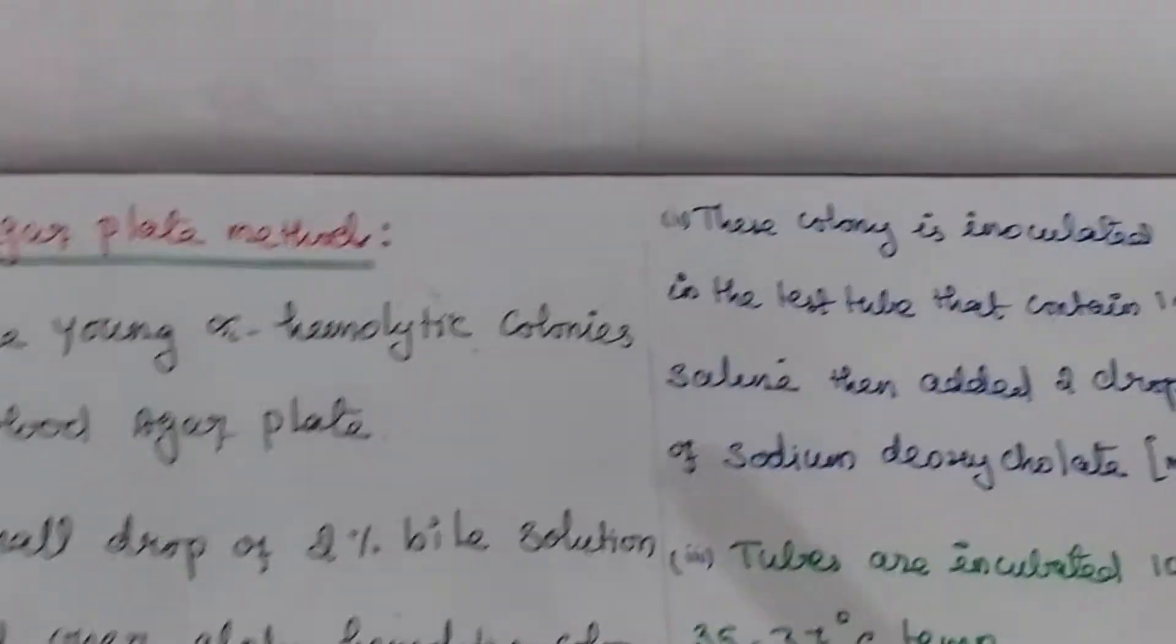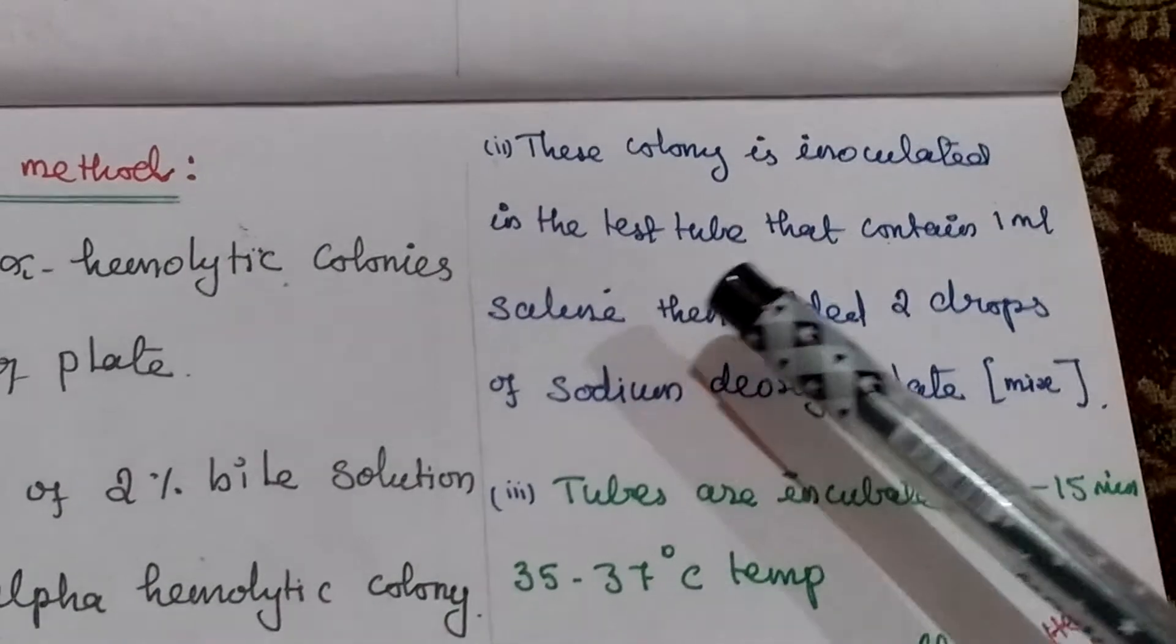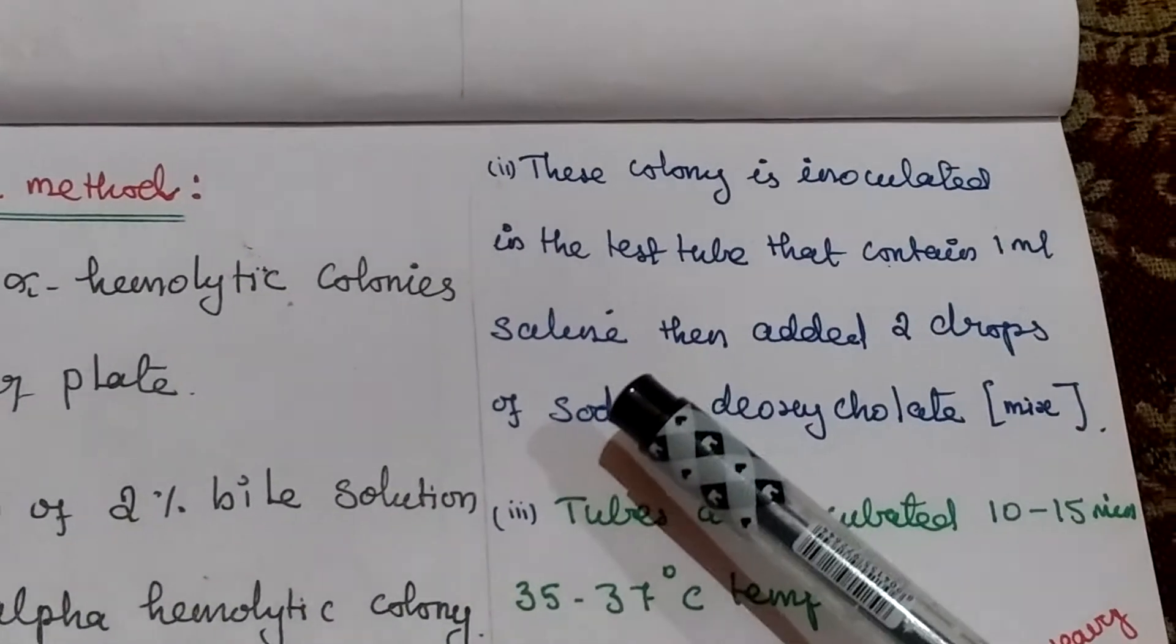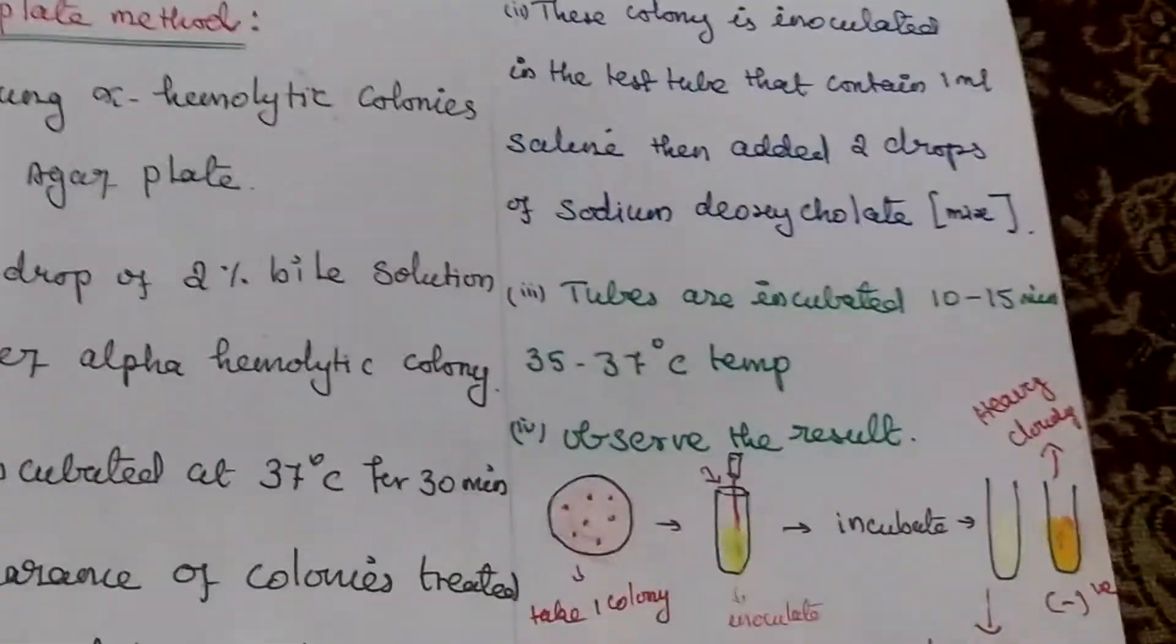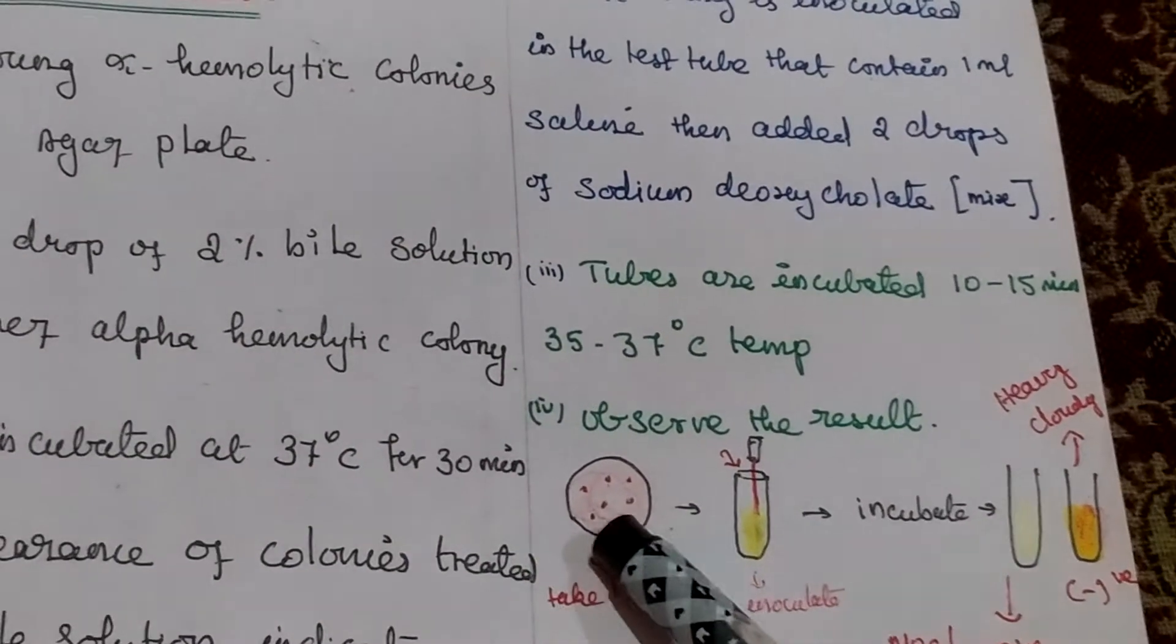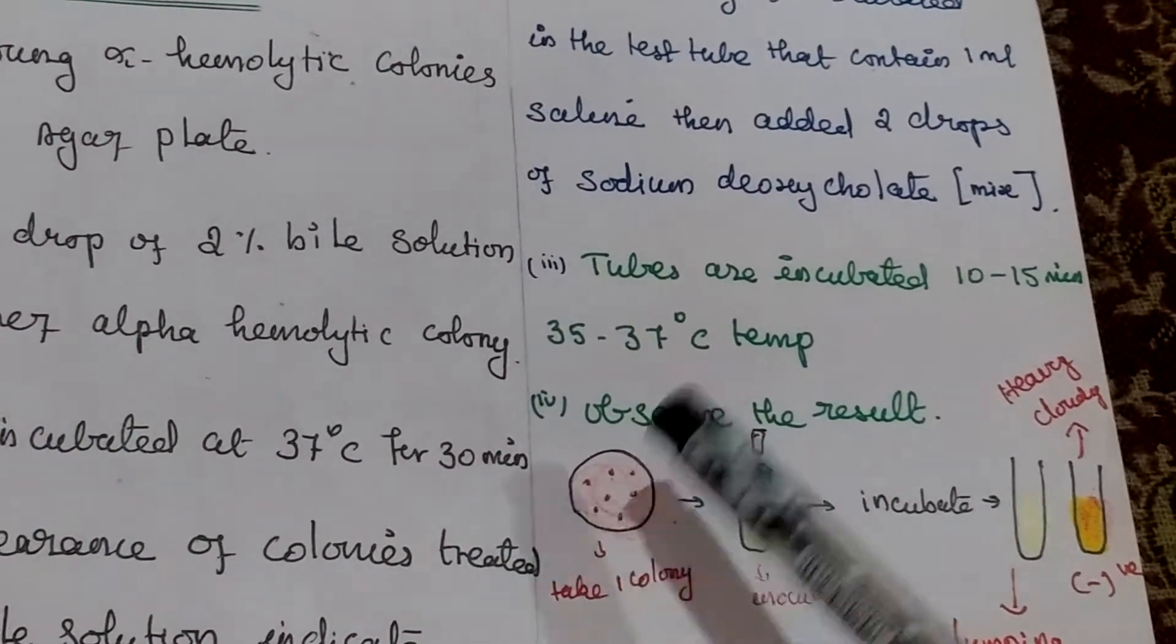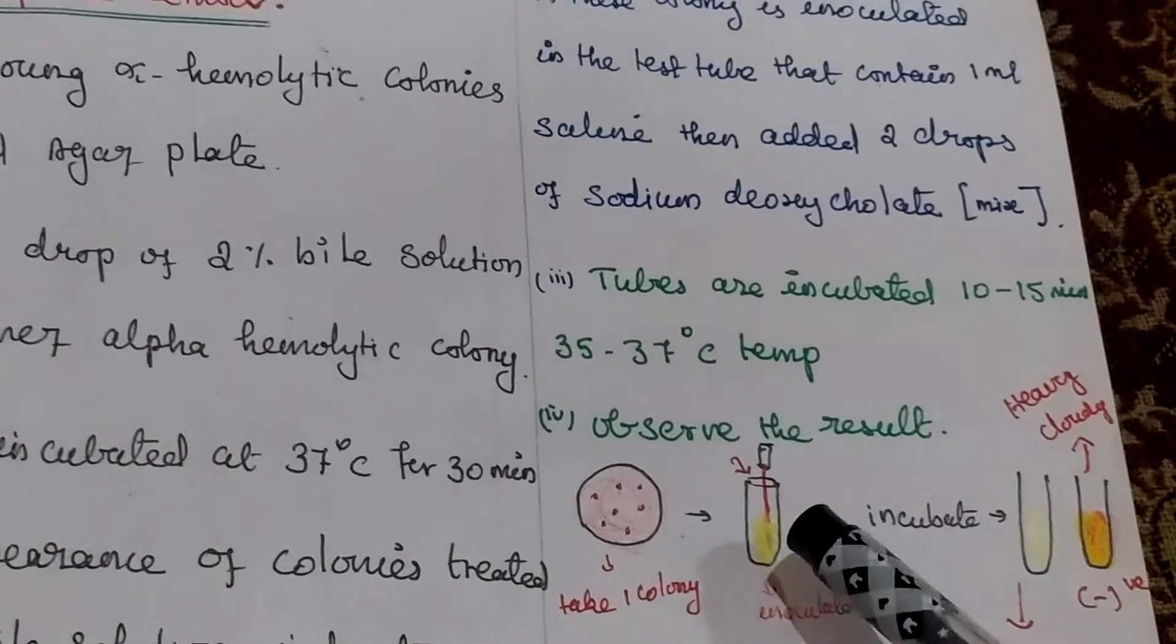After that this colony is inoculated in the test tube containing 1 ml of saline. Then add 2 drops of sodium deoxycholate. This one is blood agar plate. We will take one colony and inoculate it to this test tube.